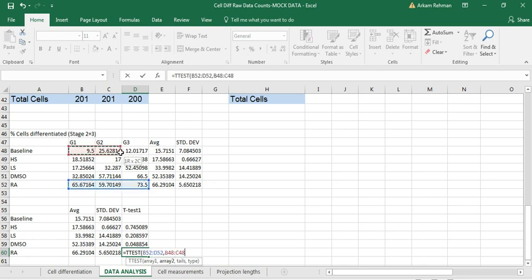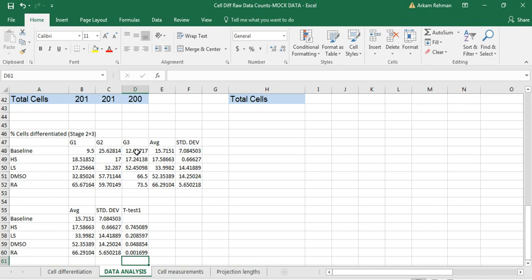And this is the last one that I will actually show you. 2, 3. And this one is highly significant because this number is way below 0.05. You are going to repeat that for all the various combinations that we had talked about in class and that are also present in the PowerPoint associated with this. So you can run those and see which ones are significant.